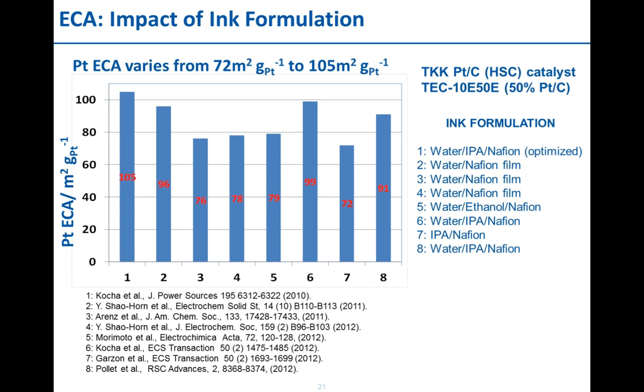And this is just a small sample of what's out in the literature. We could not fit all of them on the graph, but there are papers where you have much lower surface area. So it's important to spend some time optimizing the ink formulation. Next slide.